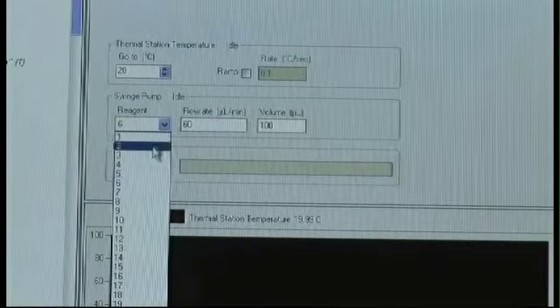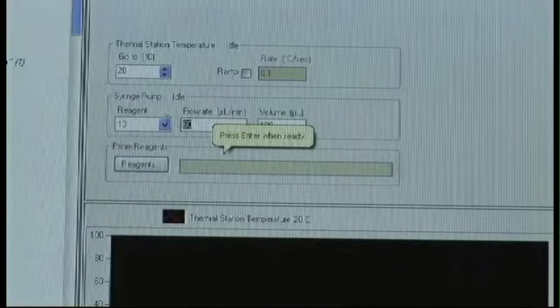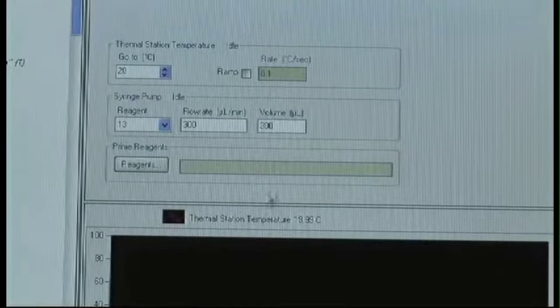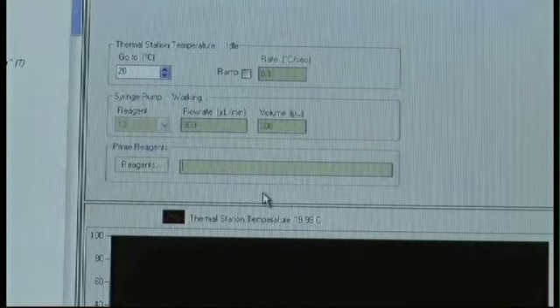In the cluster station software, select Reagent 13, or any reagent position that just contains water. Pick a relatively high flow rate of about 300. Don't set the rate greater than 500, because that can wear out the syringes. Next, select a relatively high volume, such as 300 microliters, and hit Enter. This high-pressure, high-volume flow should force any small clogs through the lines, going through the bridge manifold and not through the Flowcell.